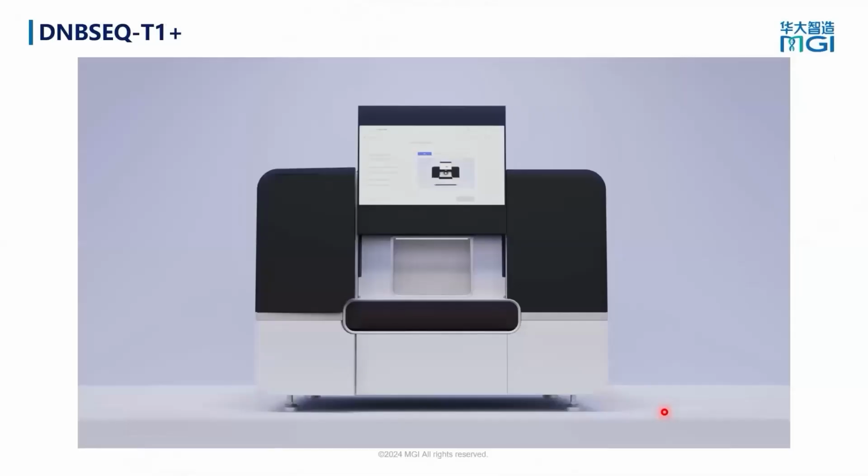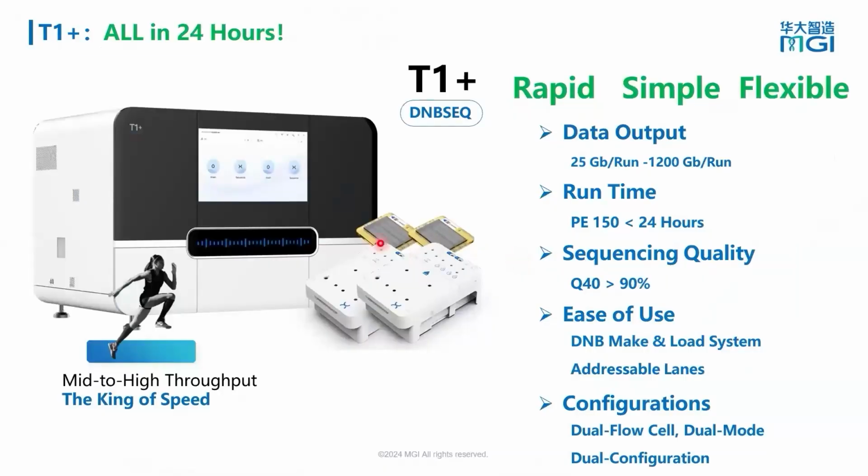So coming to the T1, this is the instrument that was released just one month back, I think. It is upgraded from the G400. This T1 is also able to sequence either one flow cell or two flow cells. You can run one or two flow cells separately. The T1 is one of the ultra-fast platforms, because the sequencing runtime is less than 24 hours, even for PE150 also.